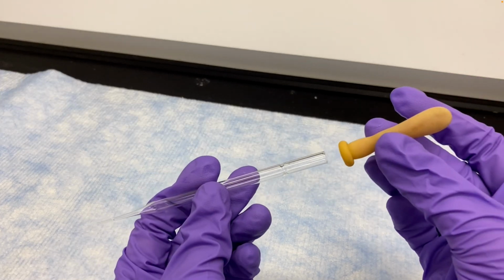So the things that are dissolved in a liquid will prefer different liquids. Camphor prefers ethyl acetate to water. It will dissolve better in ethyl acetate than in water. So the way we're going to get our camphor out of that watery reaction mixture is we're going to shake that mixture up with some ethyl acetate, and the camphor will move from the water into the ethyl acetate.